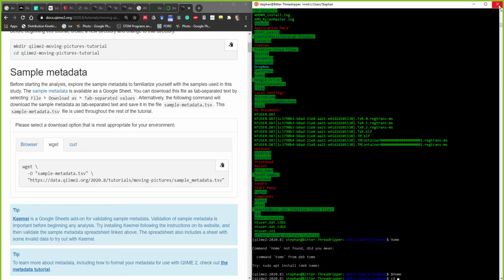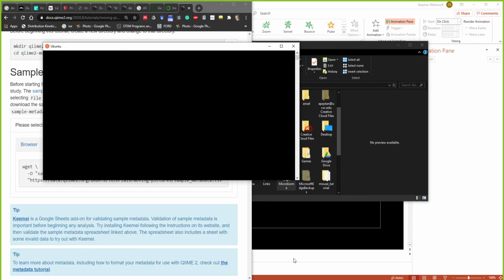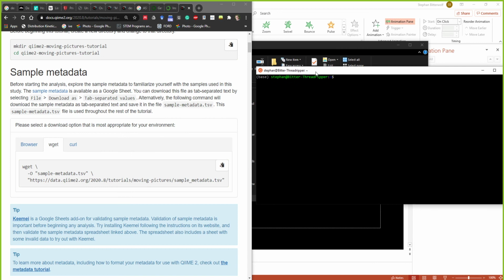Let me just open Ubuntu up again. Try closing it, Mike, and just opening Ubuntu up again and starting from there. It might be that you're just further up or something, and that's affected. That's fair. What you can do, if you're in base, type in ls. See if you can cd to mount, which I can.